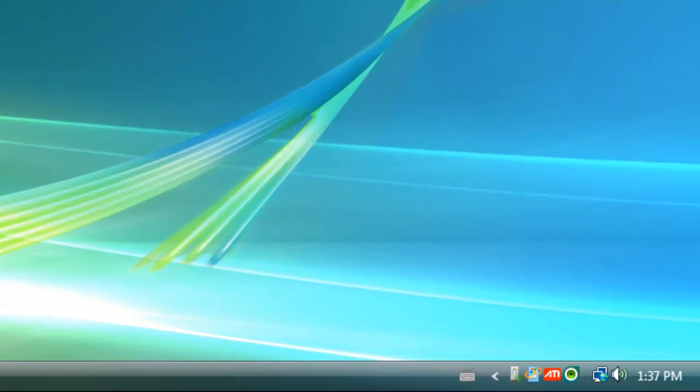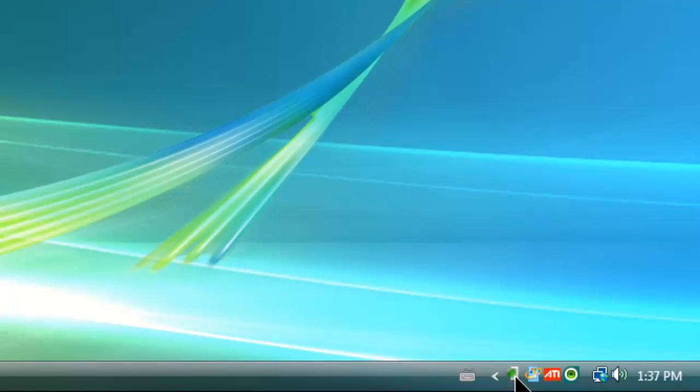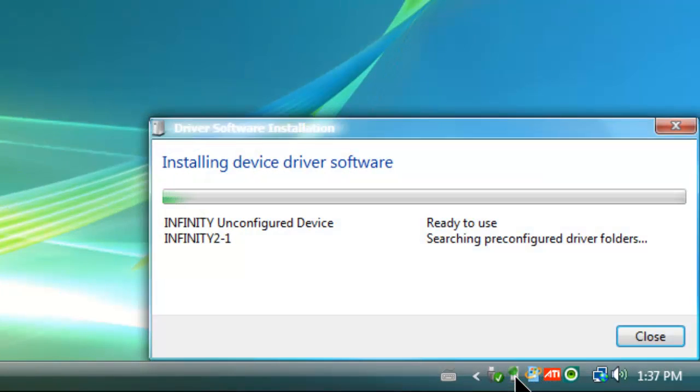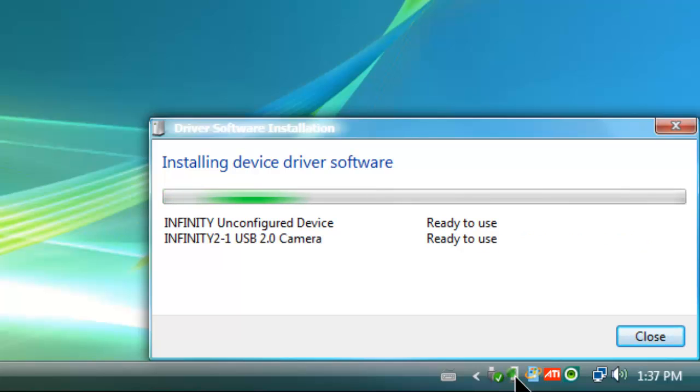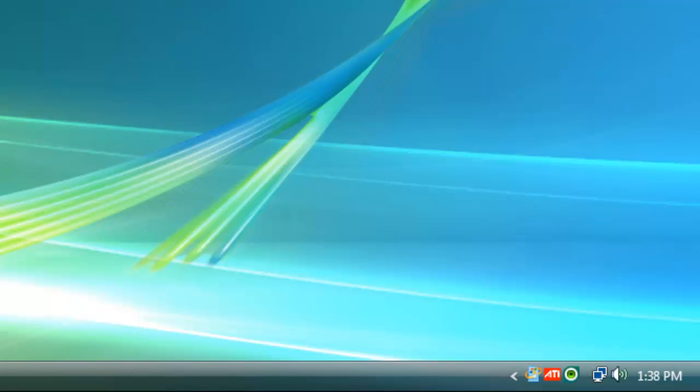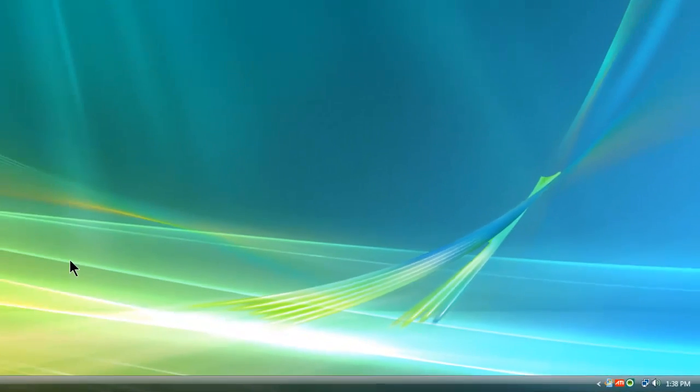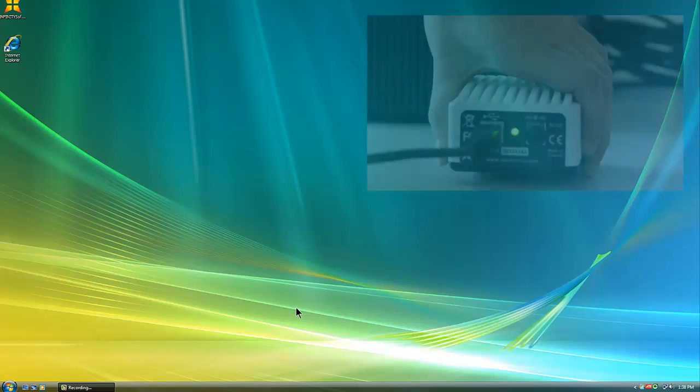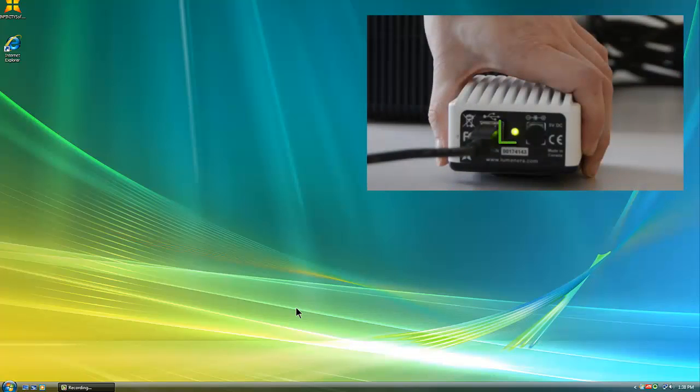Your computer will automatically install the hardware drivers. This icon shows that the installation is underway. You can double-click the icon if you want to see the installation's progress. Check that the light near your camera's USB port is turned on.